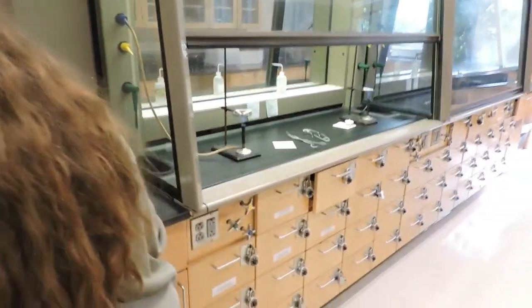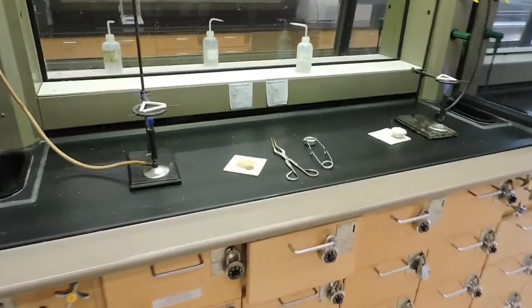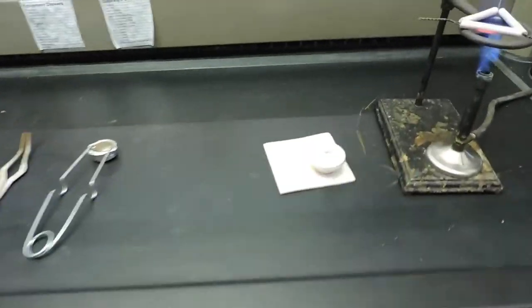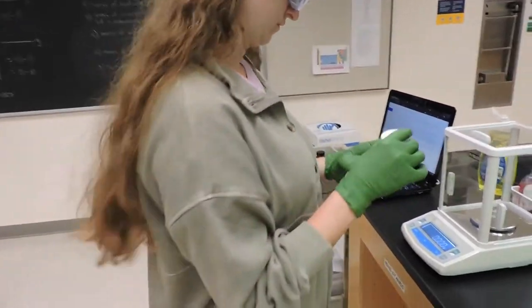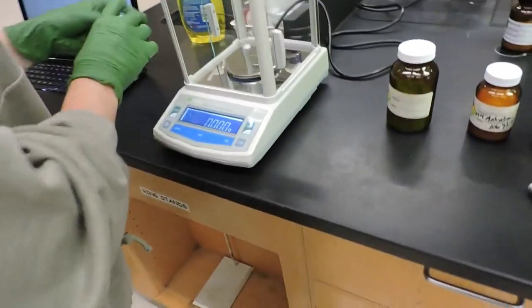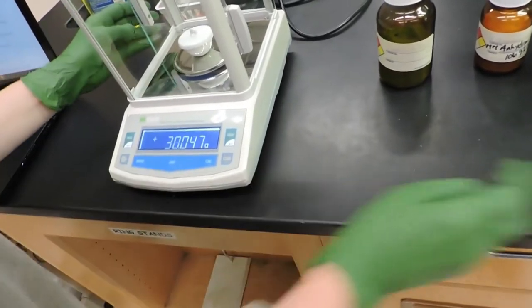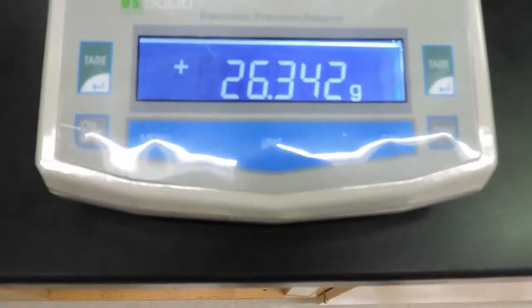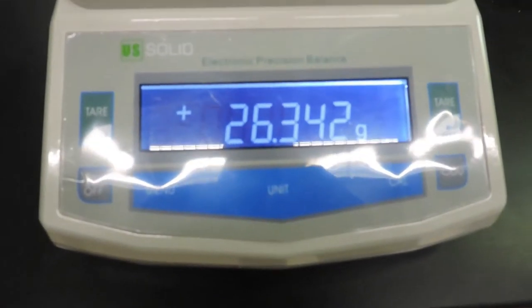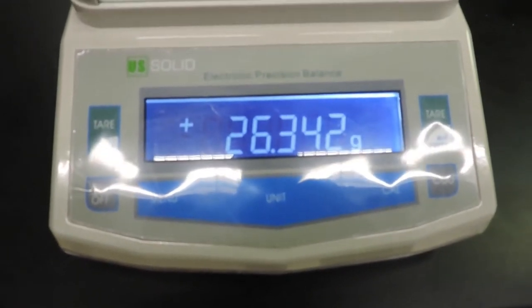To begin, we have porcelain crucibles. These crucibles have been rinsed with water and flame dried. The first step is to find the mass of this crucible with the lid. The mass of this crucible and lid is 26.342 grams. Record this in your notebooks. We'll record it up here.